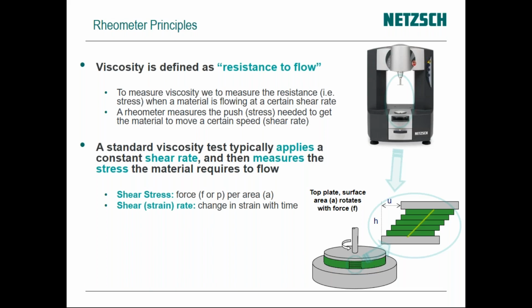But for viscometry, obviously you need something that can flow. So you'd be limited maybe to something as stiff as maybe Play-Doh or silly putty, asphalt, also if you do a very slow test. But generally, if you go to really, really hard test samples, then you do an oscillatory testing, because the sample won't stay under the plates or in between the geometries. It would tend to ball up and come out. It just doesn't like to flow. And so we wouldn't do viscosity usually on something that's so solid.